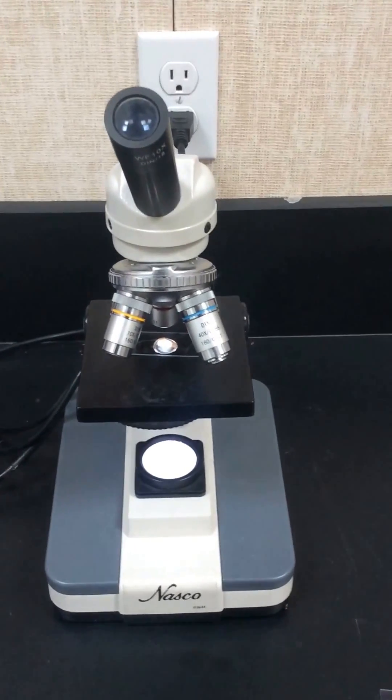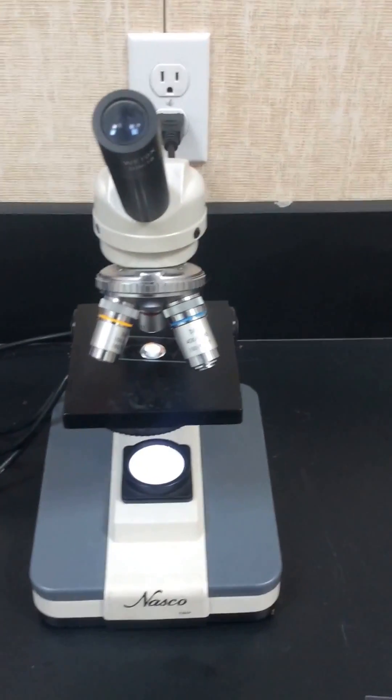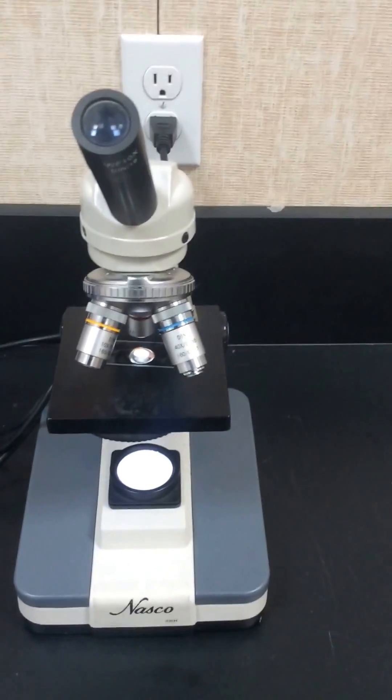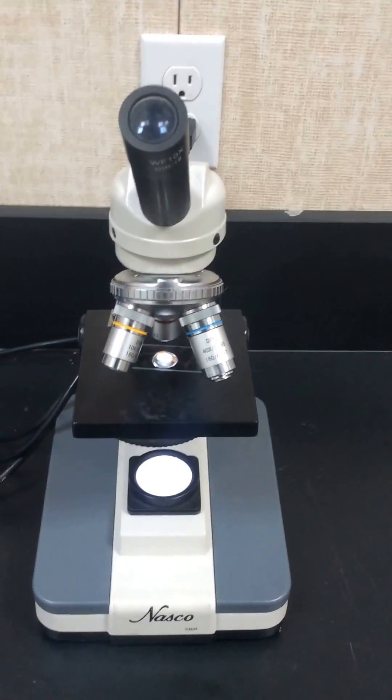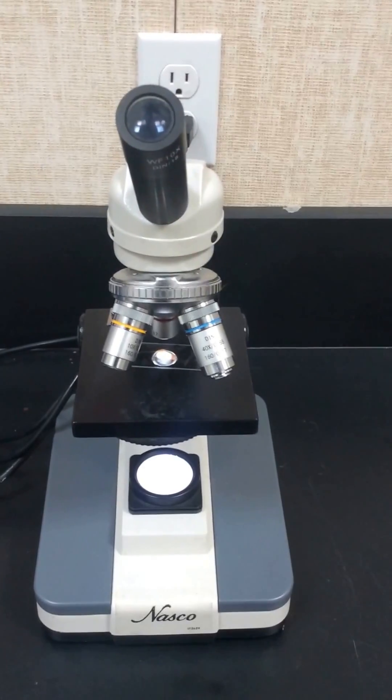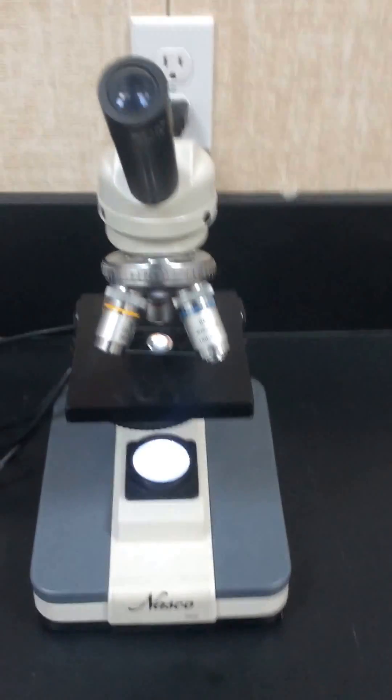This video is going to show you how to take pictures of your microscope specimens using an iPad.